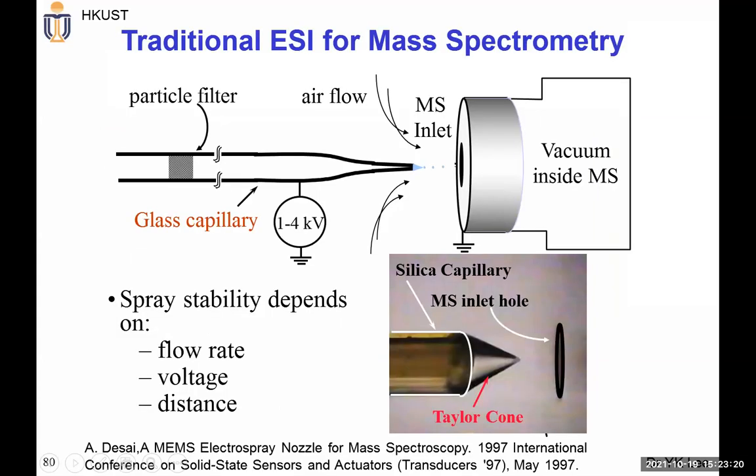So basically, we just mentioned this another branch of this kind of device. Actually, this device is also quite important for microfluidic mass spectroscopy. The idea is that traditional mass spectroscopy is most likely used for separation or analysis of protein or some biomolecule.